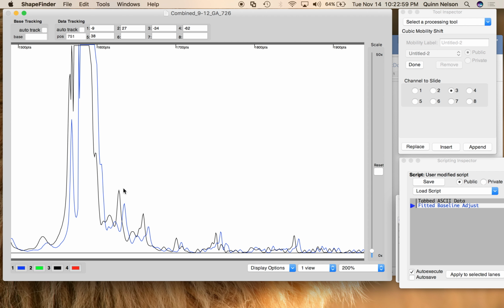This is what it's supposed to do. So what you just did is you aligned part of that electropherogram to the blue electropherogram, and that's ultimately going to influence the polynomial equation that this algorithm has, all the math behind it, and those are the constants that we're going to record. So each time that we do this, there are little data files that are generated.